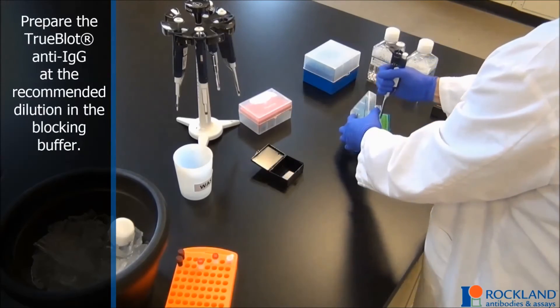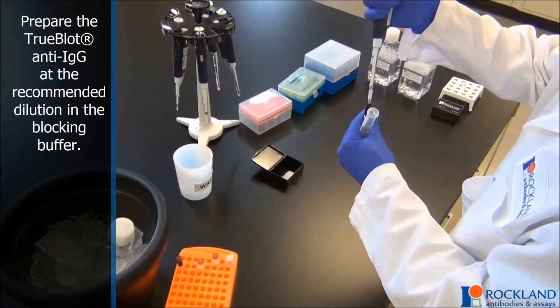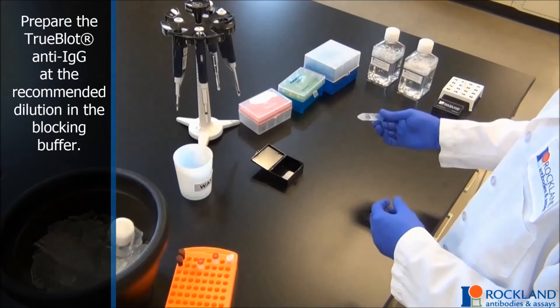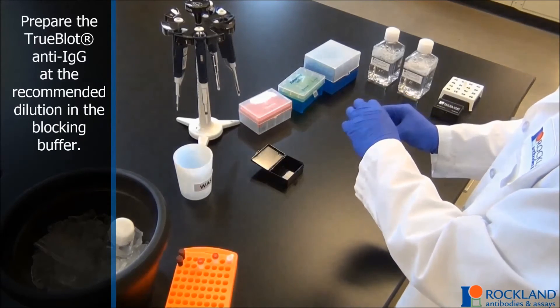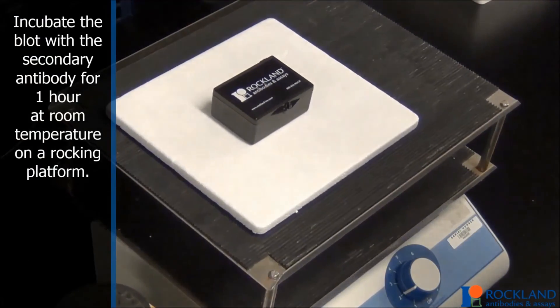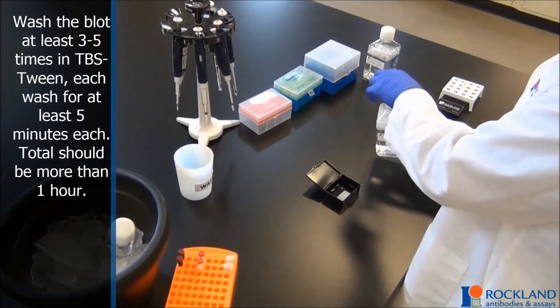Prepare the TruBlot Anti-IgG at the recommended dilution in the blocking buffer. Incubate the blot with the secondary antibody for one hour at room temperature on a rocking platform. Wash the blot at least three to five times in TBS-Tween. Each wash for at least five minutes each, for a total of more than one hour.